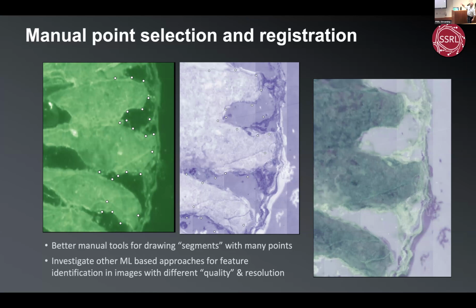One of the next things you'll see, I won't promise it in 3.10, but 3.11 for sure, we'll have better ways of drawing and segmenting things to actually make these alignments better.